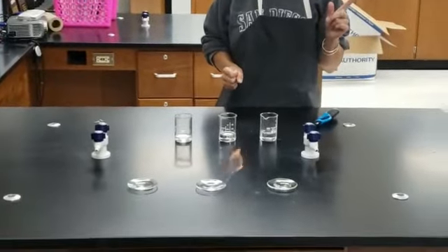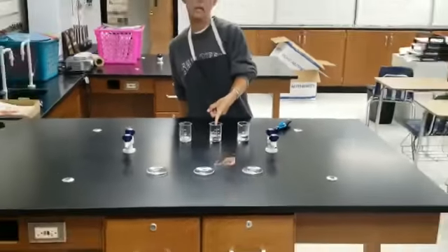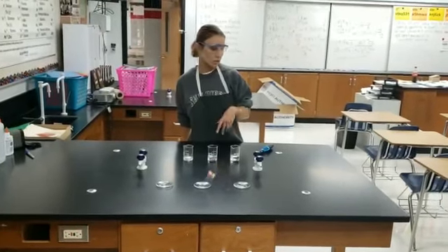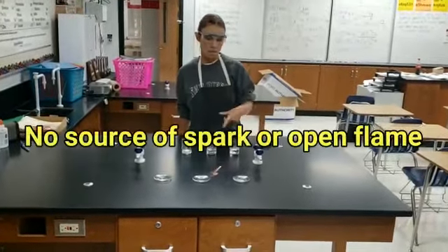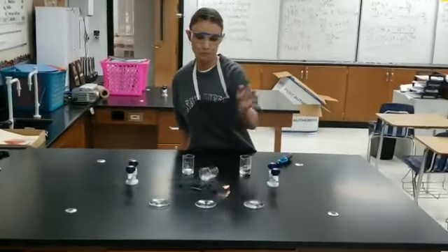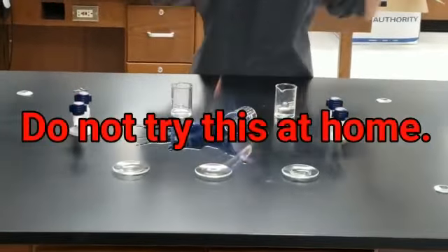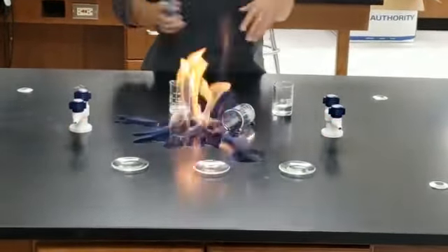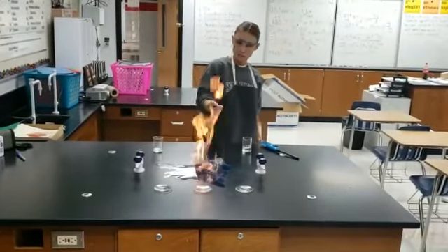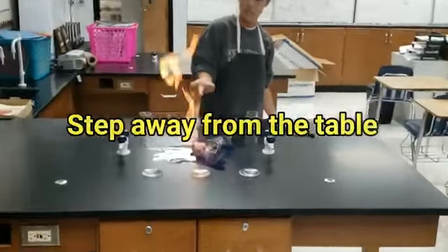Also remember this: when you're working with liquids, and especially with a flammable liquid like this one, it is important not to have an open flame. Because if an accident happens and there is an open flame — bam — your thing is on fire. And then what do you do? If something like this happens, don't panic. Just tell the teacher and we can take care of it.